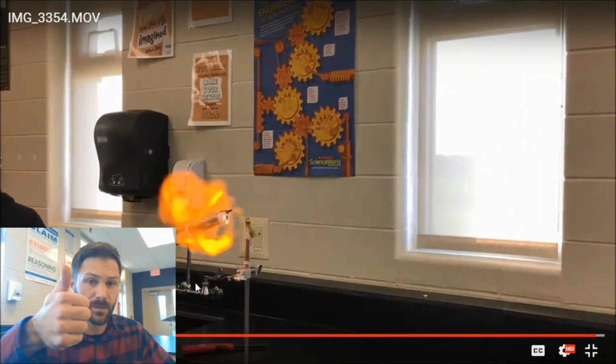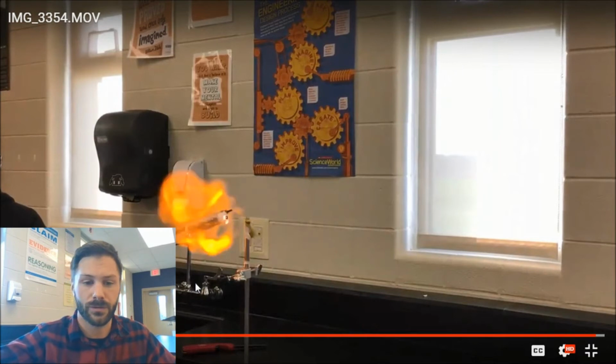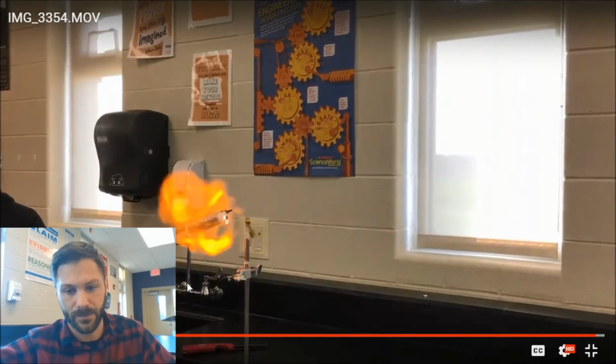That gives us another major piece of evidence that tells us what this gas might be inside the balloon. Flammable, less dense than air, gas filling up the balloon, and it had to come from somewhere. So think about what elements we started with. There are some major hints that I gave you that are probably leading you to conclude what gas is inside that balloon.